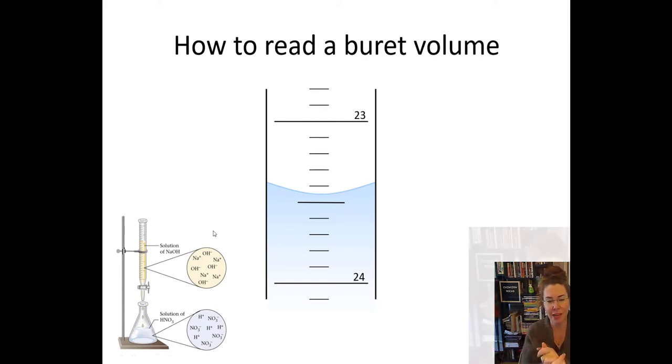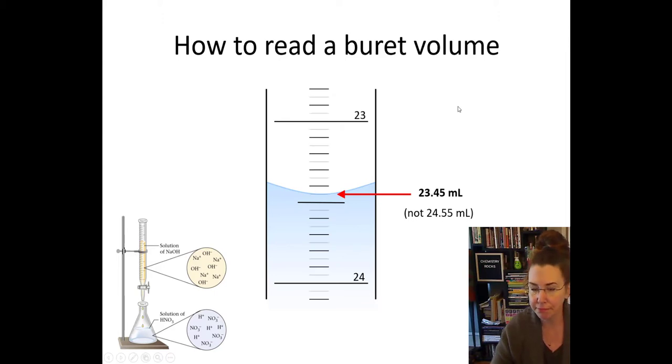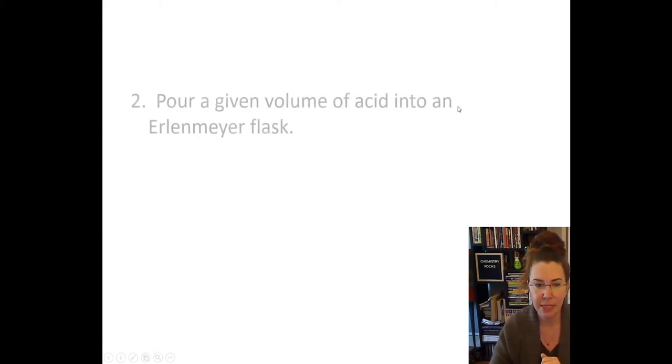Here is a burette. You'll notice smaller number on the top, larger number on the bottom. How much, or let me rephrase that. What is the proper reading on this burette? Alrighty. So if you said 24.55 milliliters, you'd be wrong. Because we don't read from the bottom up. We read from the top down. So this would actually be 23.45 milliliters. See, it's not 24.55. We're not reading from the bottom up. We're reading from the top down.